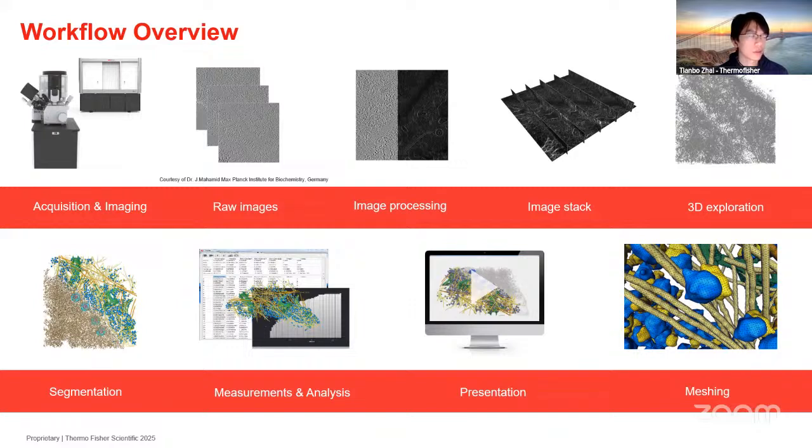You could consider AMIRA as standalone software that takes the raw images you acquired and processes them, essentially denoising, filtering, and enabling the initial 3D exploration. I think one of the strengths of the software is that it takes 3D data sets pretty well, so that we can have a sneak peek into the data set even before we start the official analysis.